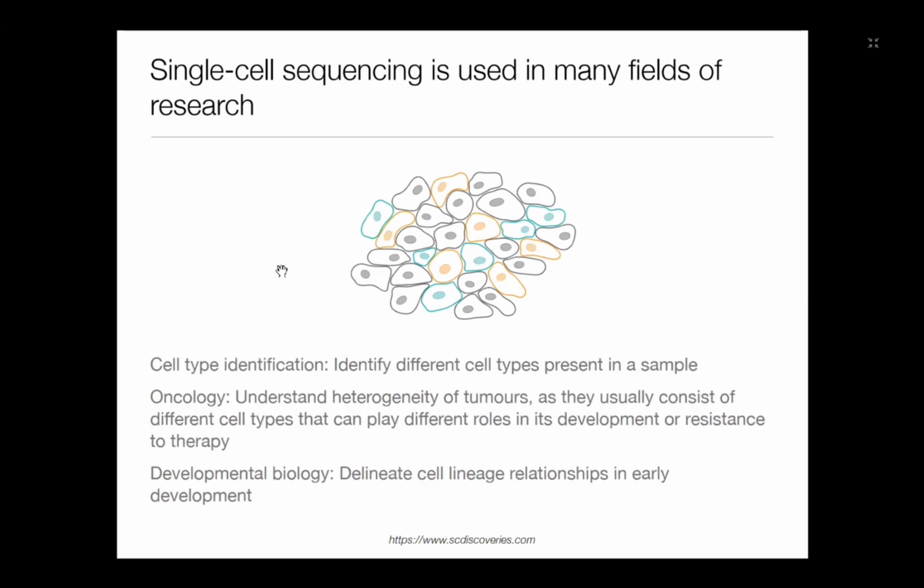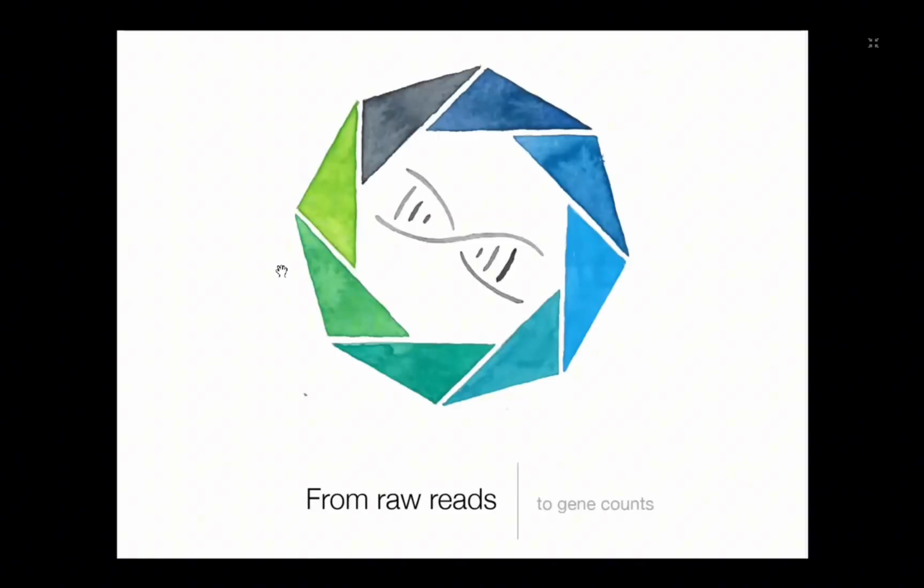I just give this question to you, to the audience. I have some more questions in the lecture. So maybe someone of you would like to answer, why are we still using bulk sequencing? It's just simpler, and sometimes it's enough. Exactly. So let's move on.